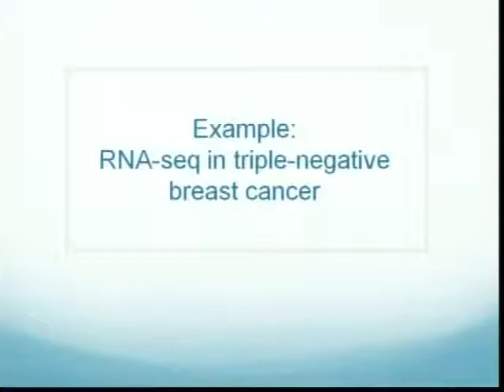Yeah, I completely agree with you. And you also showed in earlier slides that it depends on the biological question you want to target. If you want to find out gene fusion, exactly. That's exactly right. It depends on your endpoint. But if you're doing a standard gene expression experiment and you have to choose between the two, then sample numbers are where you want to be.